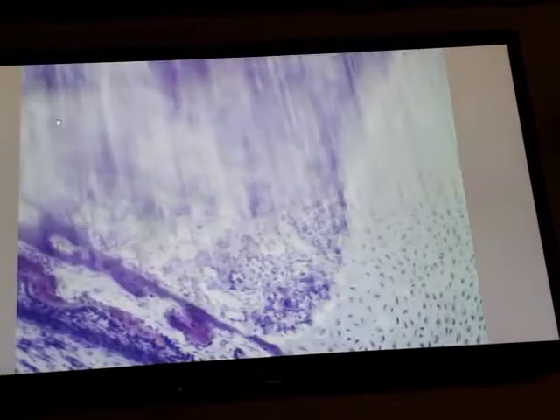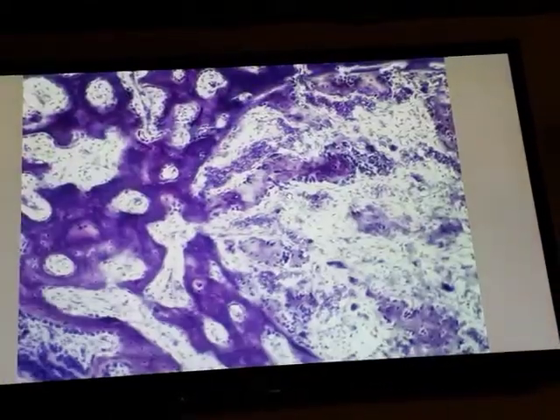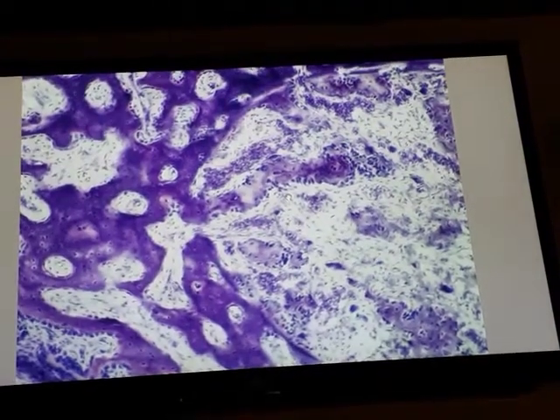To summarize: the first zone has only chondrocytes without morphological changes. The second zone is the proliferative zone with columns of stacked cells. The third zone is hypertrophic with large chondrocytes and cytoplasm filled with glycogen. The fourth zone involves death of chondrocytes and calcification of the matrix septum. The last zone is the ossification zone, where endochondral bone tissue appears.